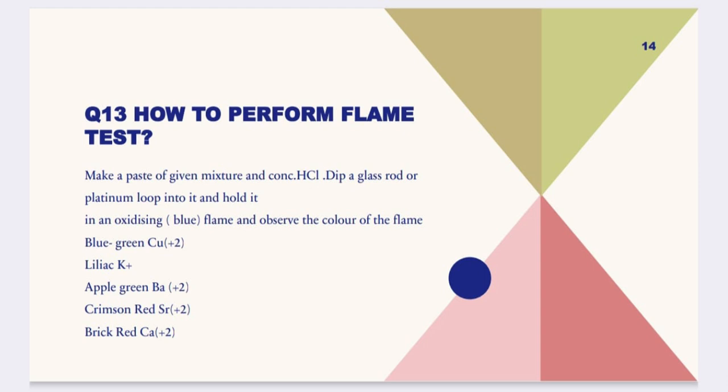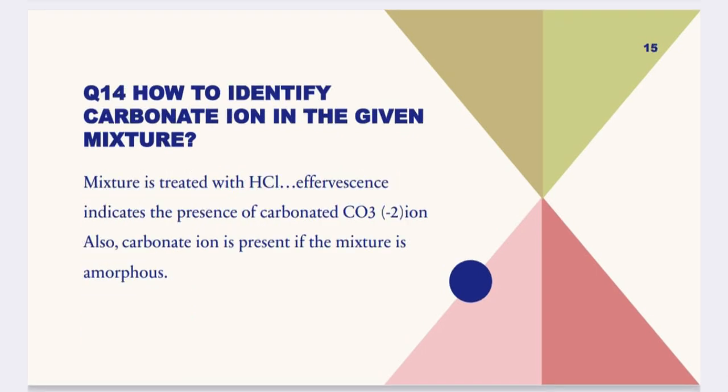We move to the next question, number 14. How to identify carbonate ion in the given mixture? My dear friends, the mixture is treated with dilute HCl. Effervescence is produced, which indicates the presence of a carbonate ion.